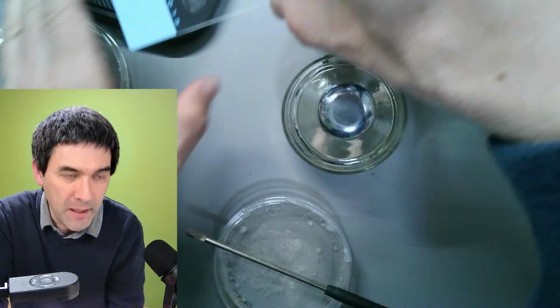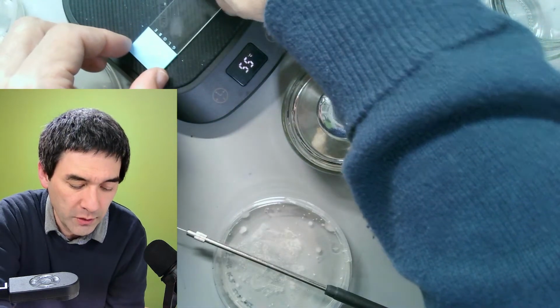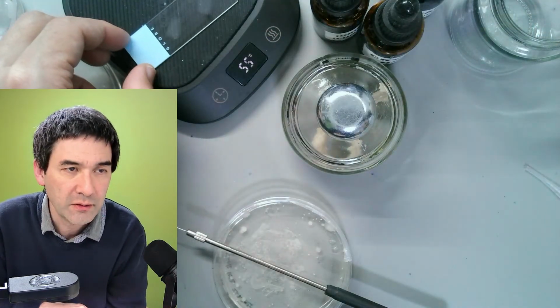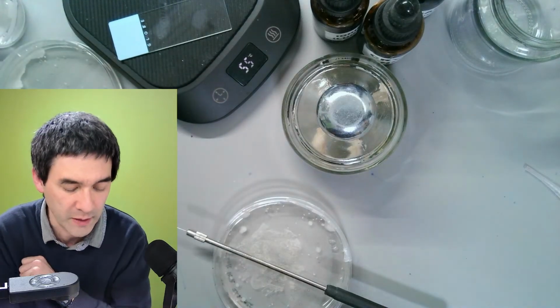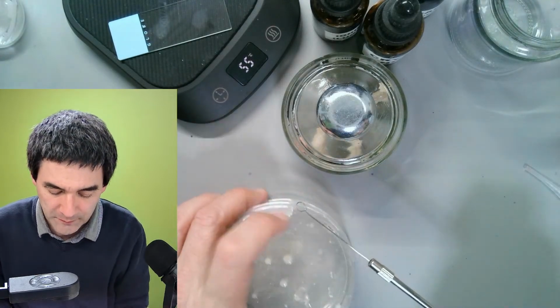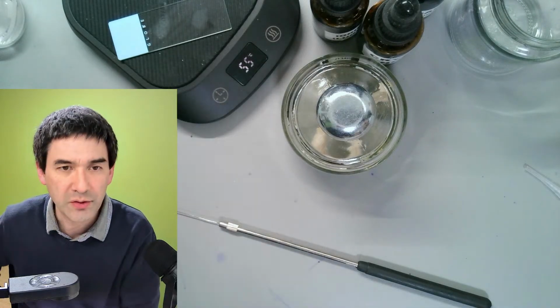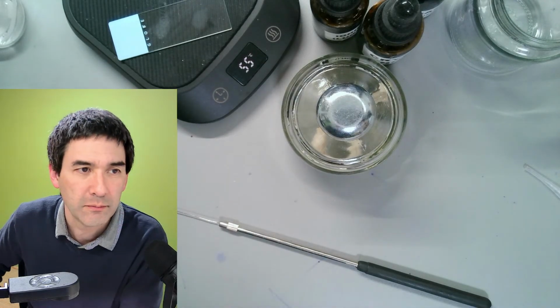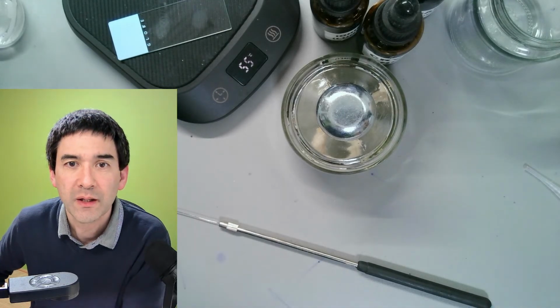Because I'm very impatient, I'm going to just use my coffee warmer here to air dry it. Yeah, and we're just going to wait a few minutes until it's completely air dried. In the meantime, I can do a little bit of cleanup work here. And then we're going to basically continue the actual heat fixing and staining process.